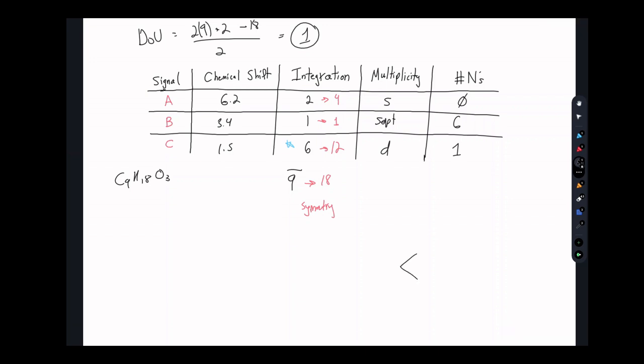That's the pattern we want to pick up on as the isopropyl group. So these hydrogens then could be signal C, right? And remember, the idea would be that somewhere else on the other side of the molecule, we would have another isopropyl group. For now, I'll just leave that empty. So signal C, right?